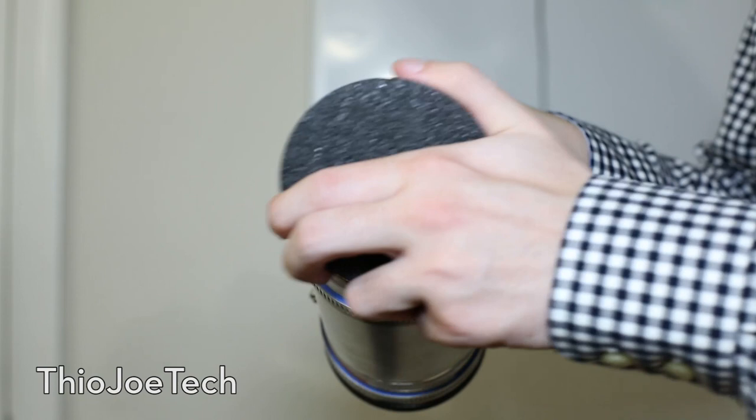This actually just showed up, and the test they use to make sure the vacuum is intact is you put ice inside. So I put a bunch of ice in there and it's pretty much all still there — I just put it in a few minutes ago so I'd hope it would be. Basically you leave it overnight, and hopefully by the next day the ice is still in there. That's a good test to show that it's working.